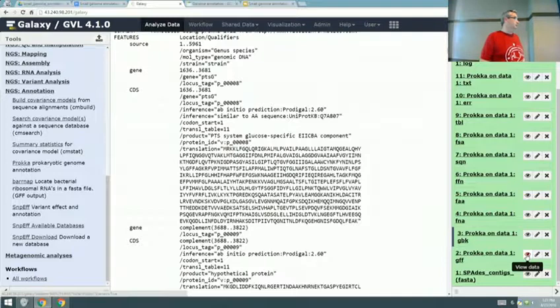PFAM has GO annotations as well. That's where we got it. Yeah, so Prokka could do it. It's just the infrastructure isn't quite there yet, and I haven't figured out a nice way. File a GitHub issue.